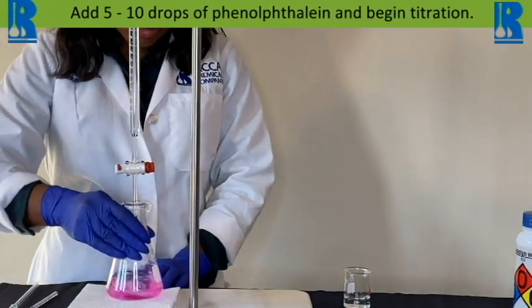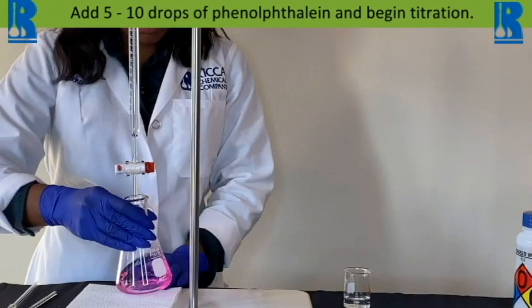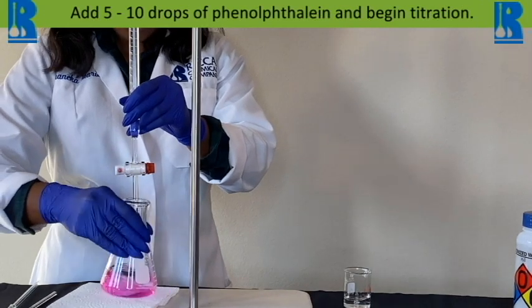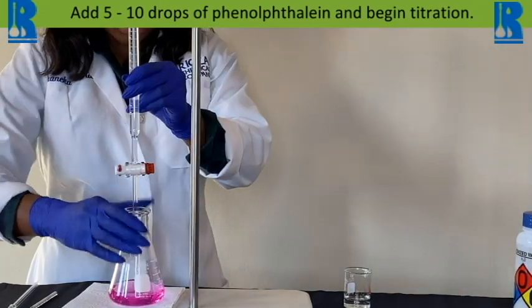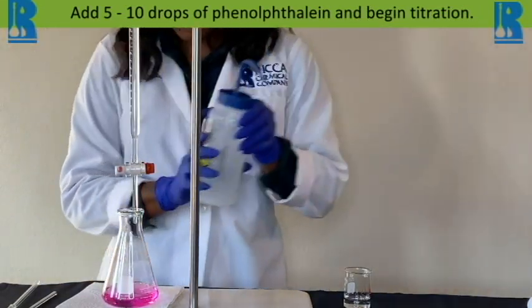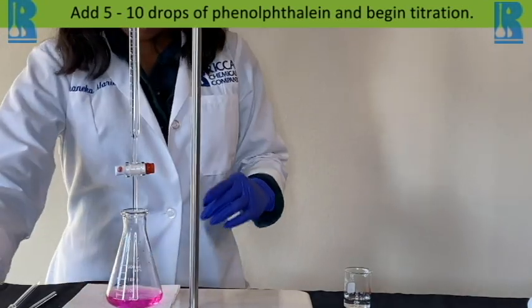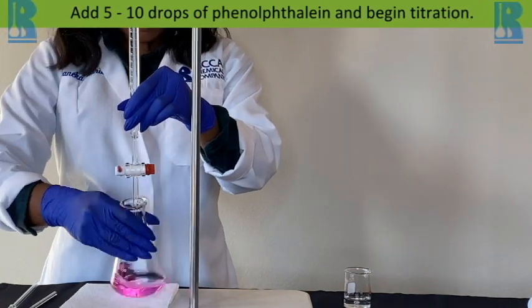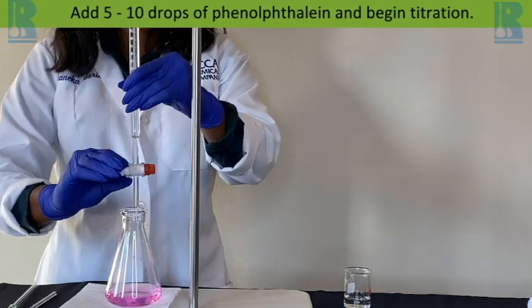Best technique is tiny flicks — make sure we do one at a time. The reason being is to make sure that we do not over-titrate. This is how you are very sure of the value that you get. I want the endpoint to be sharp — you can see it getting a little lighter. That's why you don't want to go too quick. You want that endpoint to be sharp and right on the money.